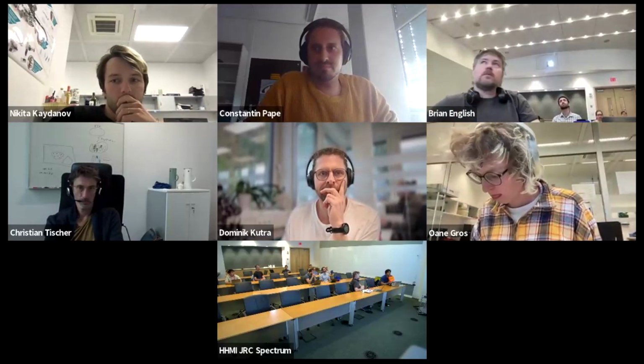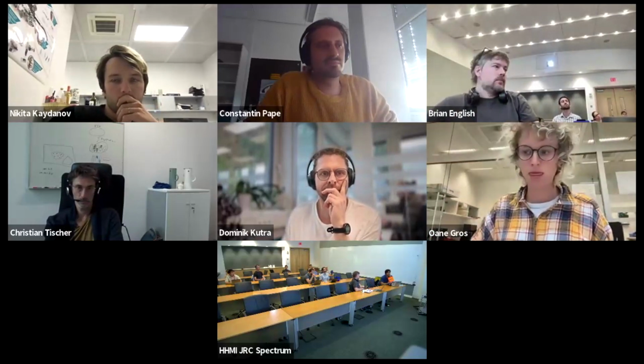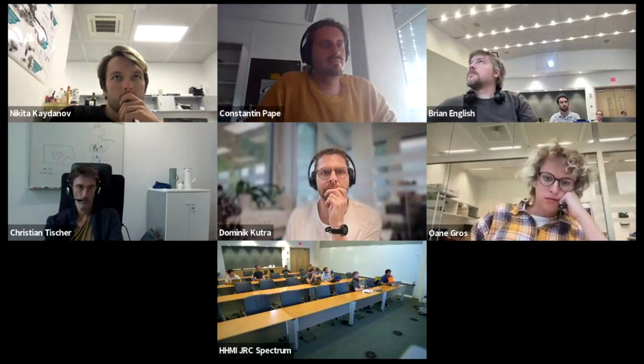Constantine, it's Mark. I was wondering, have you tried anything like the skyline approach that Meta showed, where you just have a grid of points and just segment everything under that?